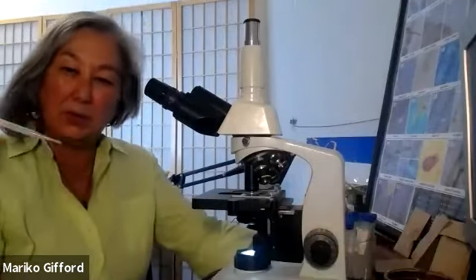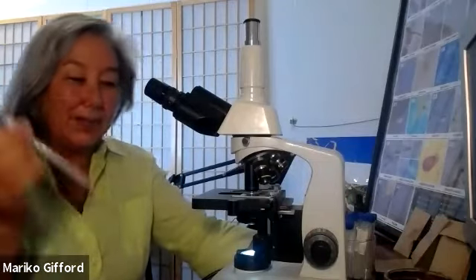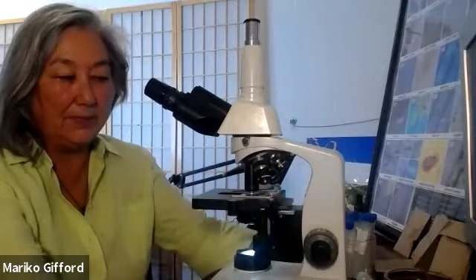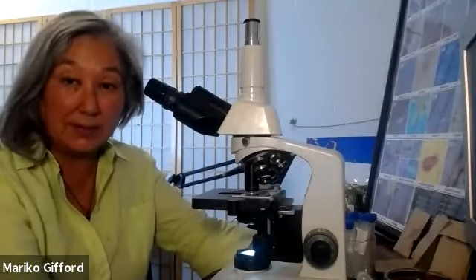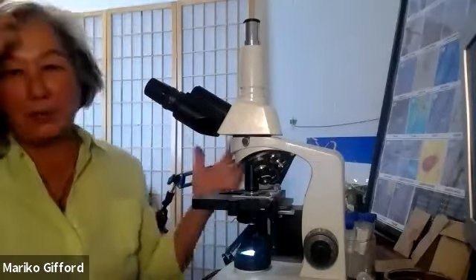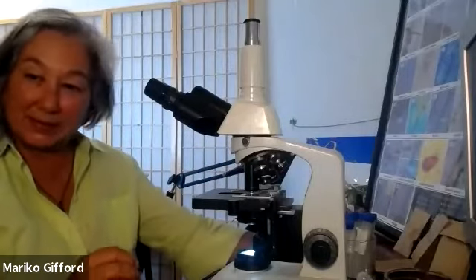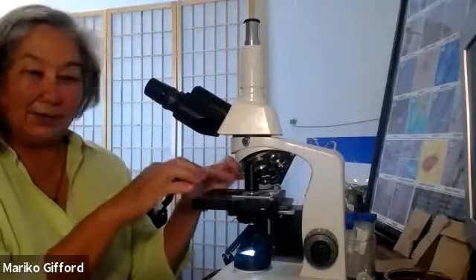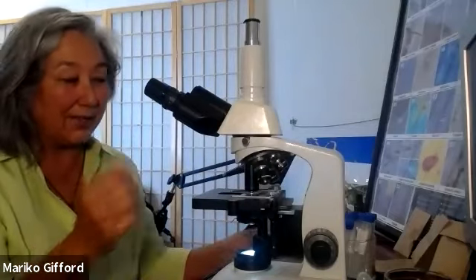And then I'm taking a pipette, or you can use a dropper, and I'm taking 1 drop of that and putting that on my slide. And that's what we're looking at. And that's what we have seen in those slides that we've looked at, 1 drop. So now you have a compost pile that's a cubic yard. You're taking these little bits of samples, you're making your microscope sample, and then you're taking 1 drop of that.